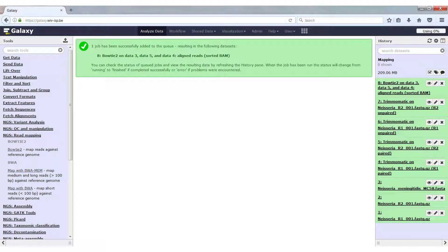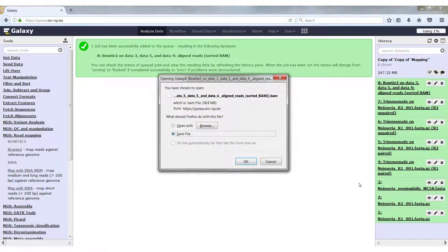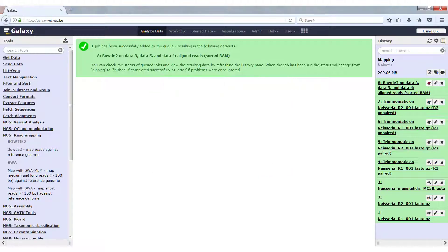Bowtie2 has finished now, and we have one output file, which is a sorted BAM file. A BAM file is a binary file, so it's not human readable. If we want to open this file and click on view data, it will ask us to save the file on the hard disk because Galaxy cannot show us the contents of this binary file. I will cancel this for now.